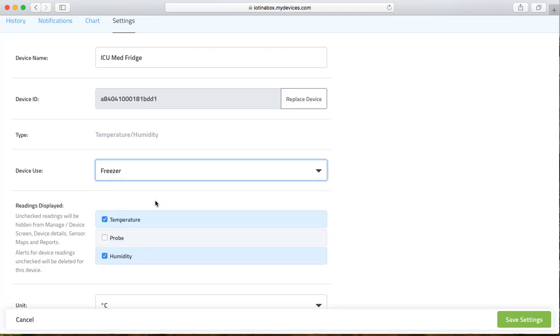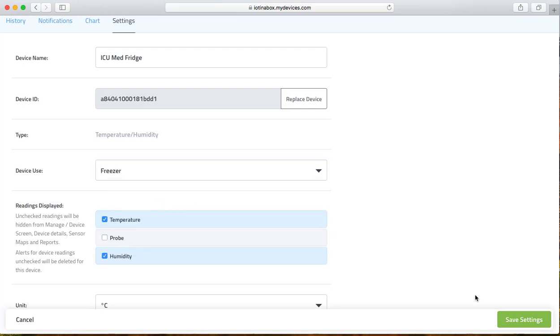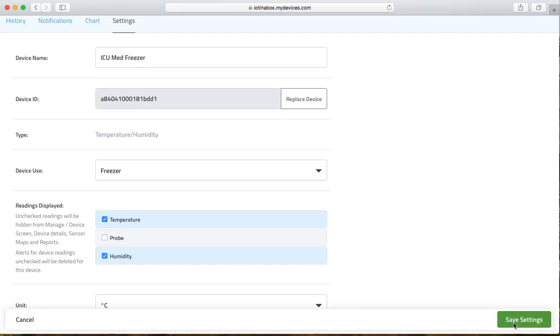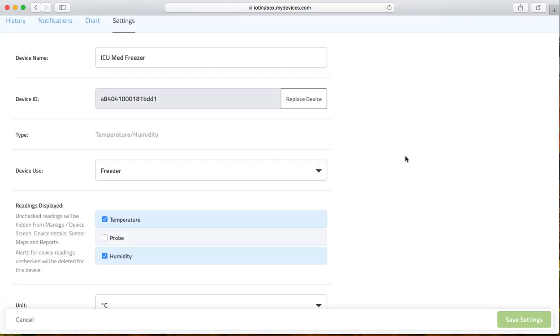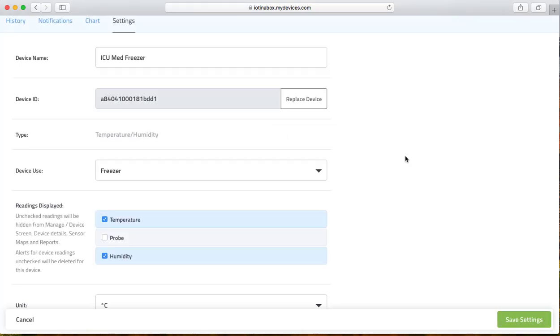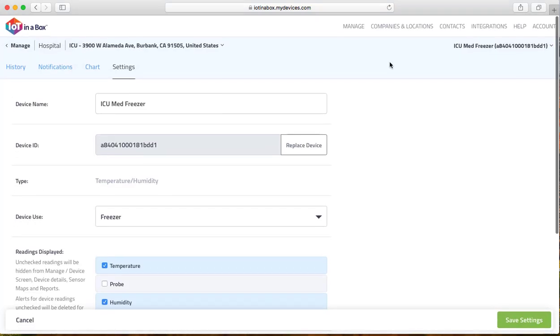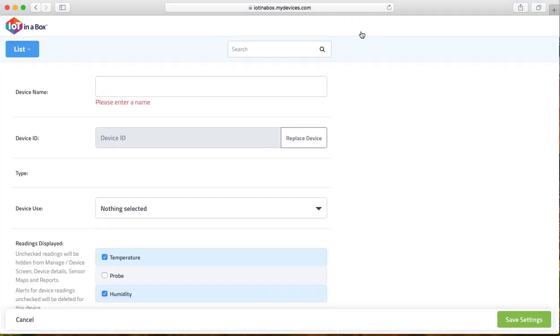We'll just switch this to freezer for the time being, and I'll change the name to freezer. Click on save, and now we've repurposed this sensor from being in the refrigerator to being in a freezer.